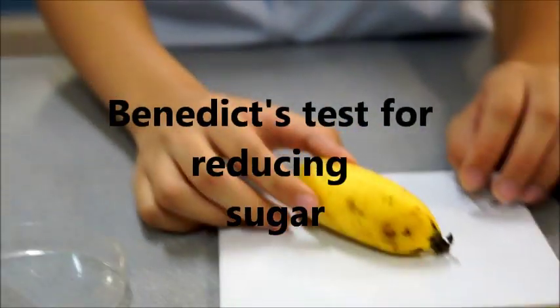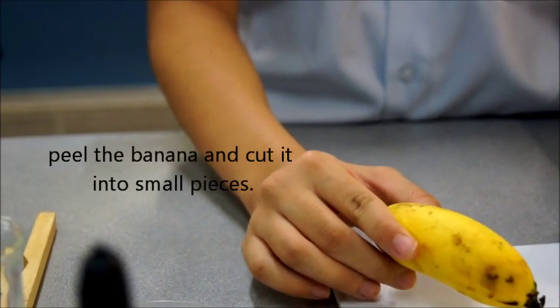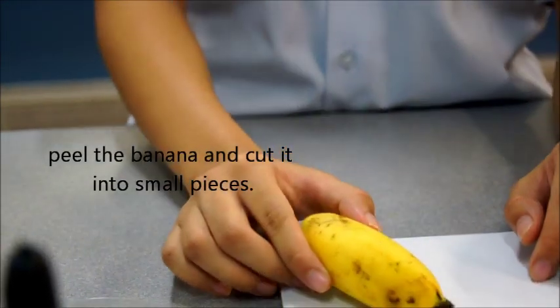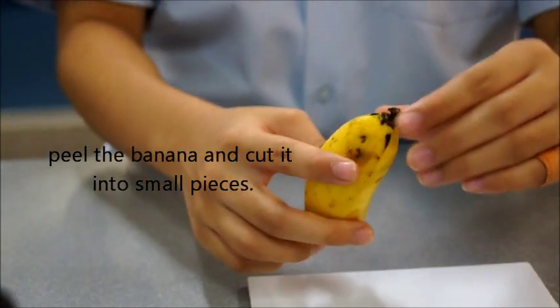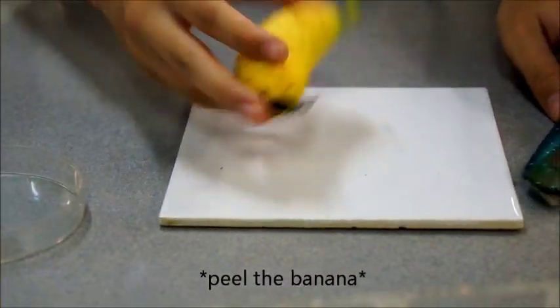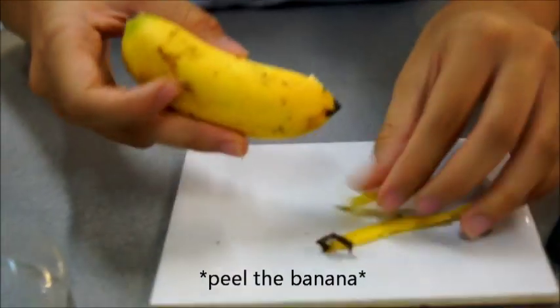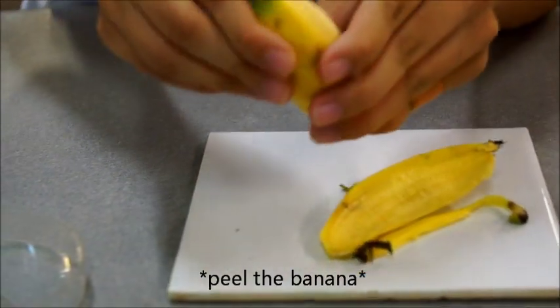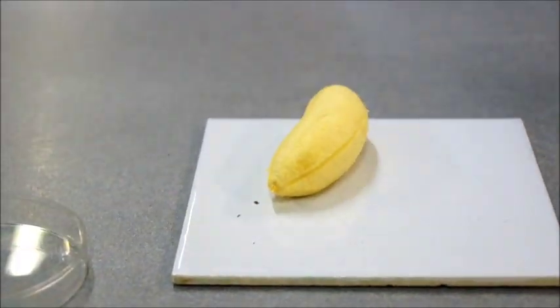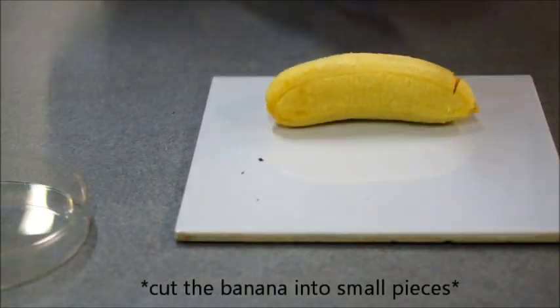Benedict's Test for Reducing Sugar. Peel the banana and cut it into small pieces.